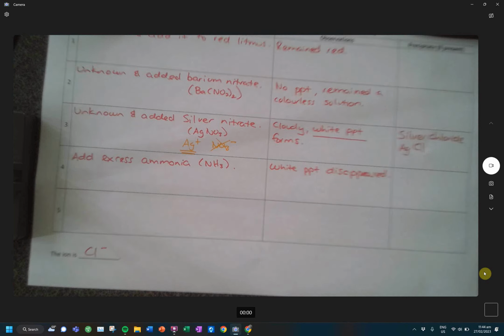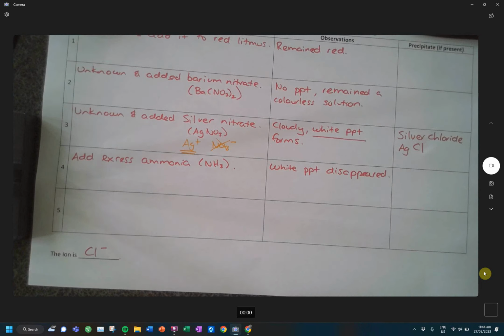Questions, concerns, comments? None? All right, you guys ready to give it a go? I'm happy for you guys to work in groups. Do you want to know what the ion is so you can make sure you're using the flowchart correctly first? Or do you want me to just put one in a beaker and you can try to figure it out? I see Xavier nodding his head like, yes, just give me an unknown. Okay, you can have it that way.